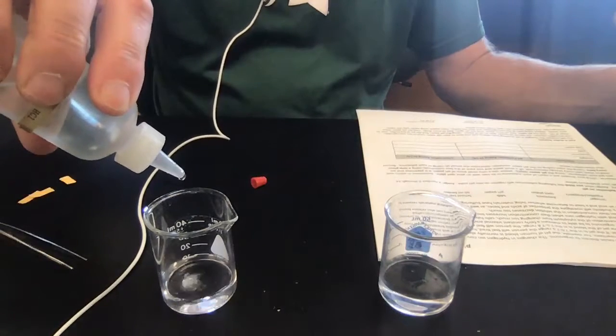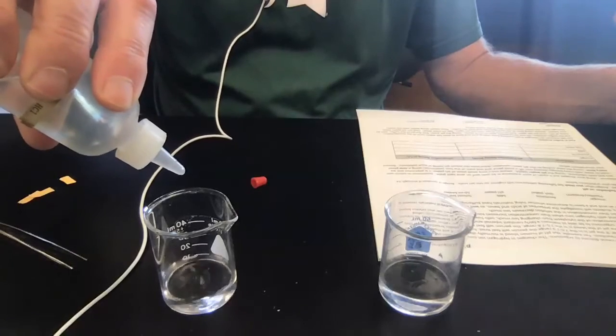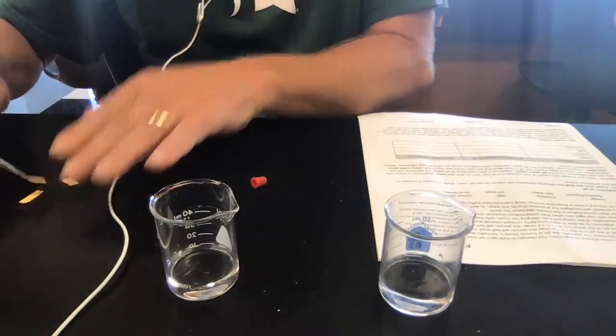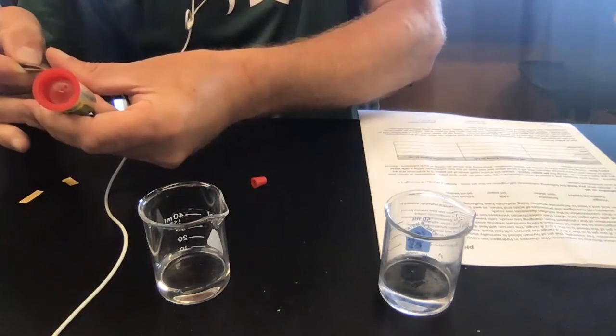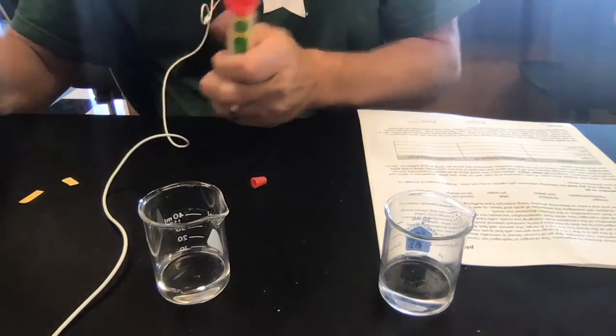1, 2, 3, 4, 5, 6, 7, 8, 9, 10. We're going to swirl that around and mix it. And then we are going to take a reading. And I can see that it's turned a little bit reddish. And boy, we are already down to a pH of 2. So 10 drops puts us down at a pH of 2.